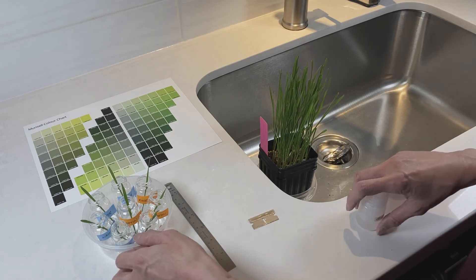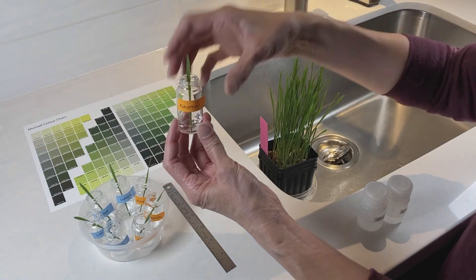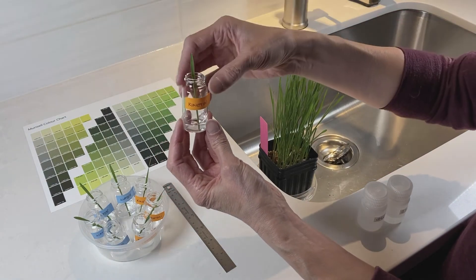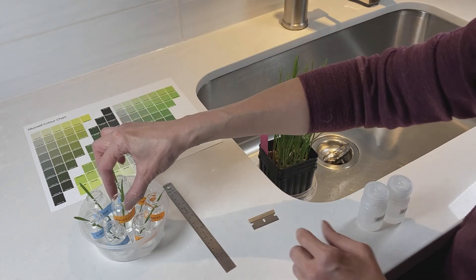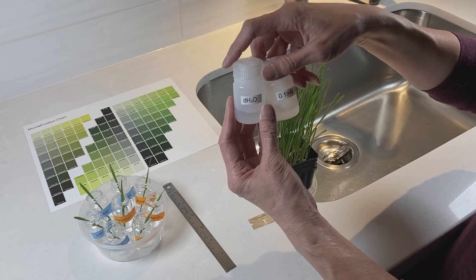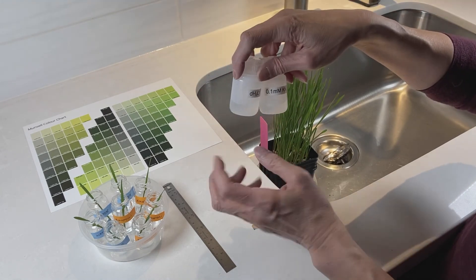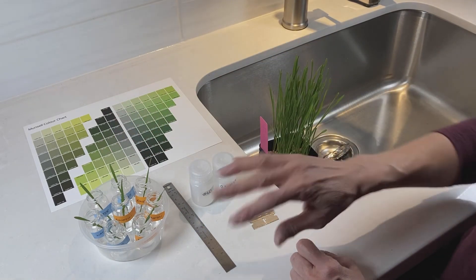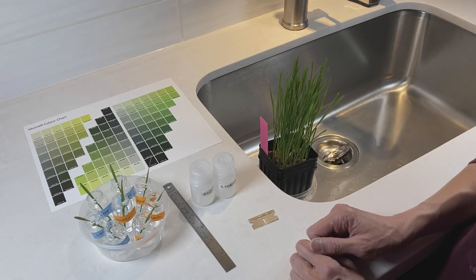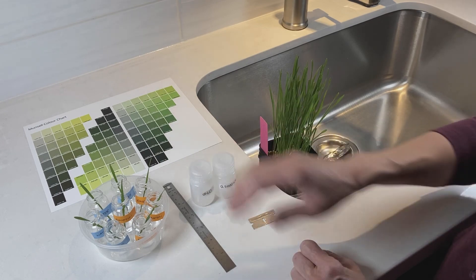One last thing: if you find when you go to measure your color that the liquid in the vials is dropping significantly, you want to top it up. There is a little bit of extra solution in each of the bottles — extra water and extra kinetin solution — so you can use your syringes to top them up. They should be fine for two weeks. I did it in my house and still had liquid at the end of two weeks, but if it's drier in your home, you might need to top it up.